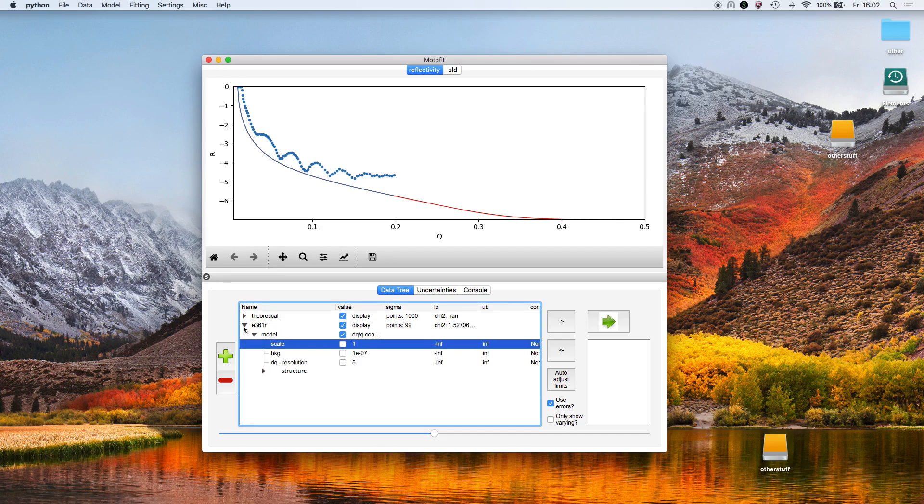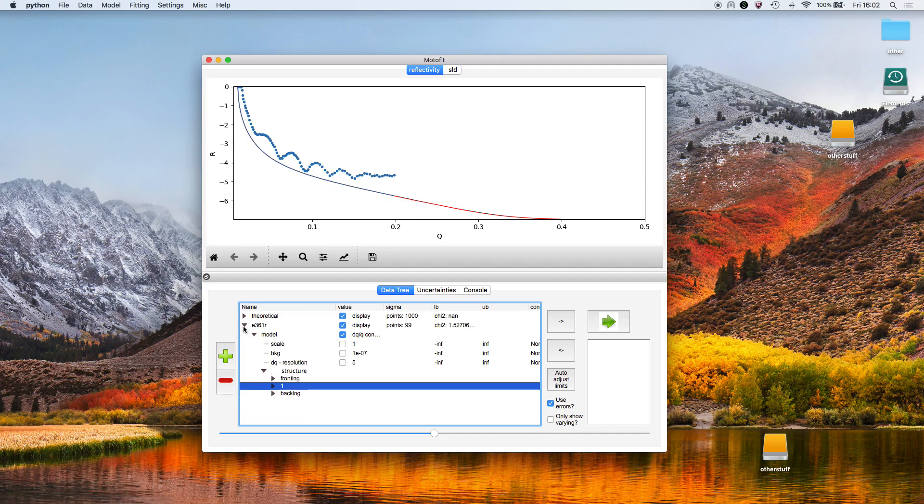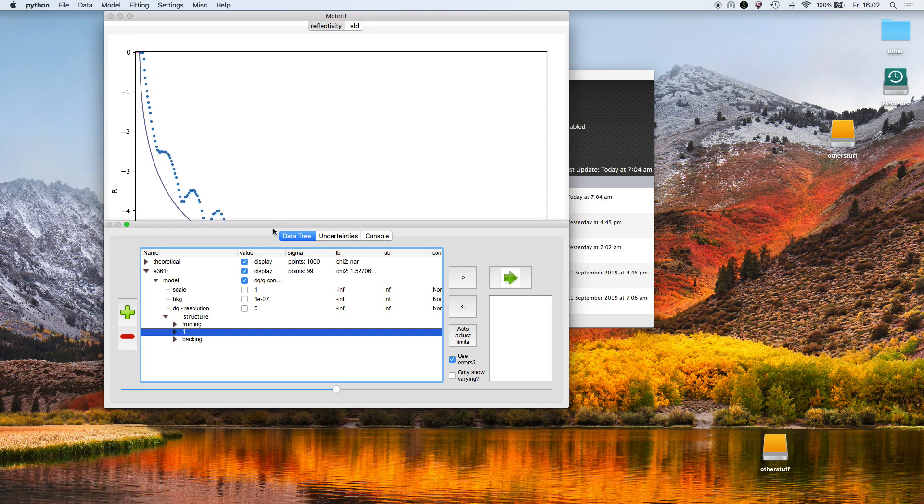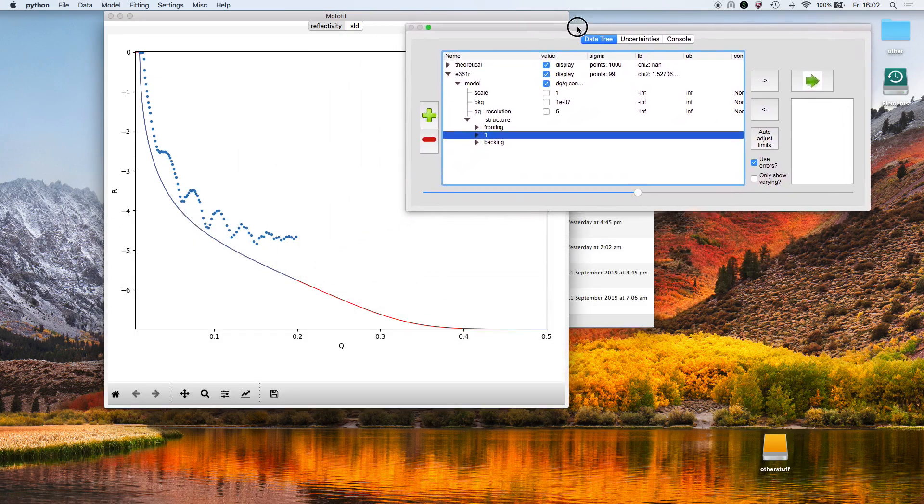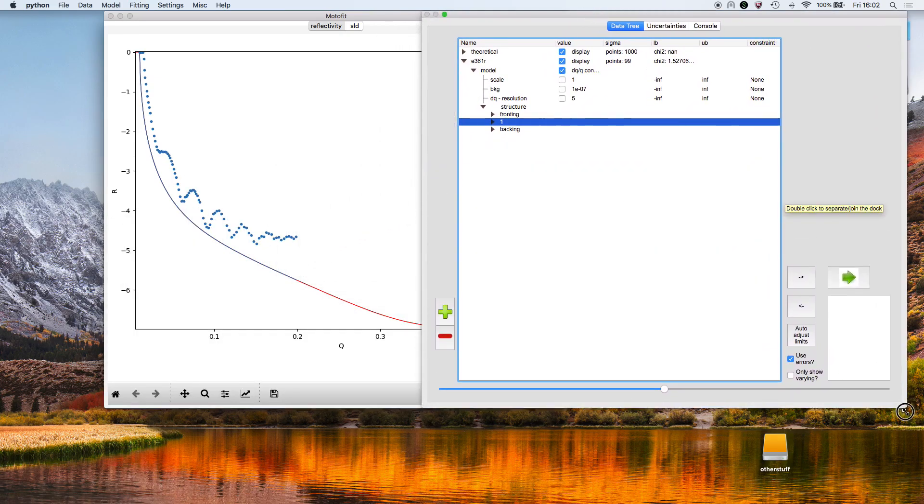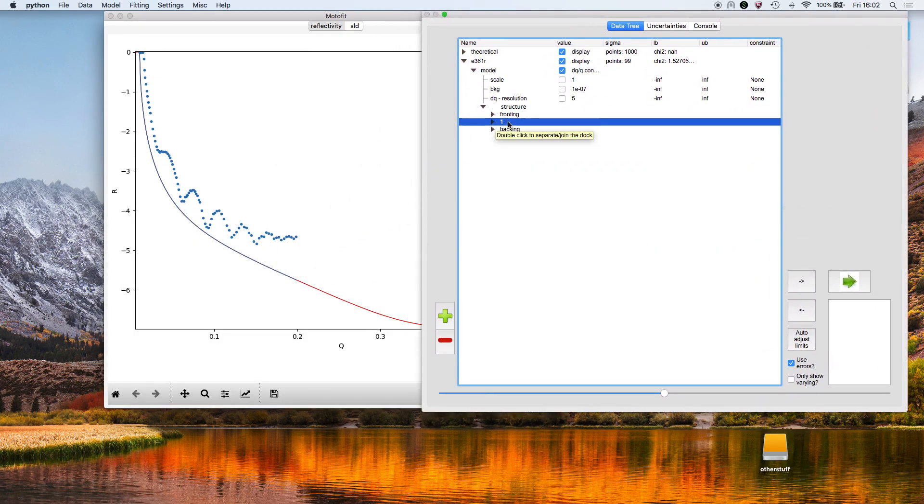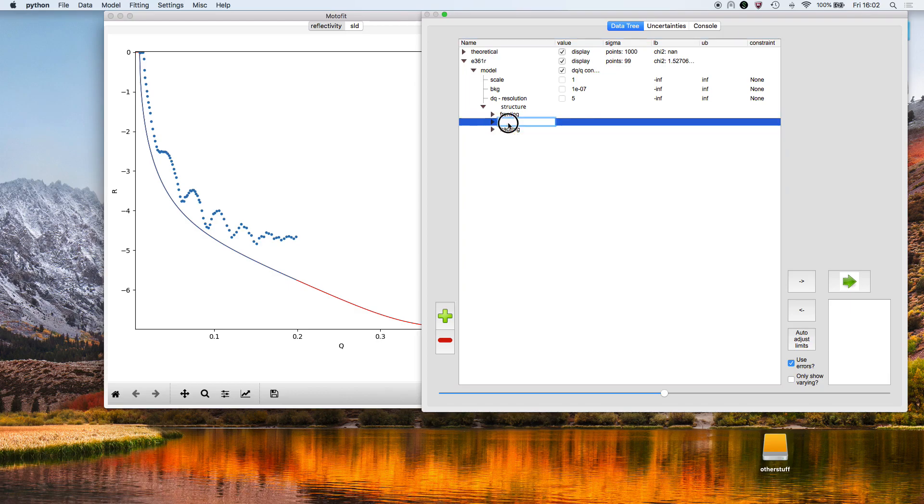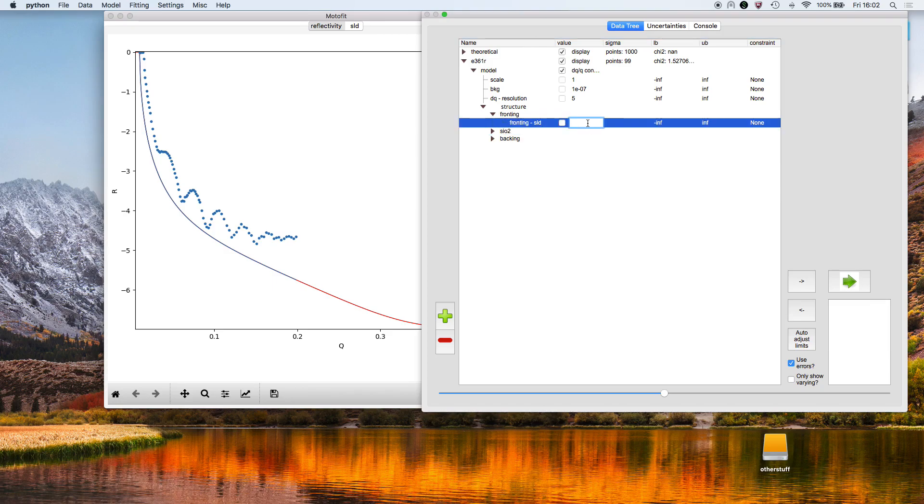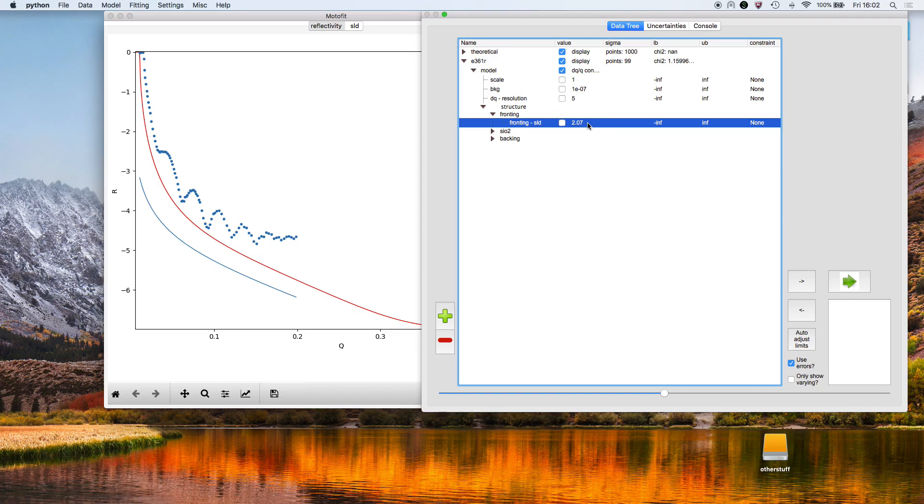First thing that we do is rename this layer to SiO2 because it's a native oxide layer. I'm going to make the scattering length density of the fronting medium 2.07—that's because the fronting medium in this case is silicon.